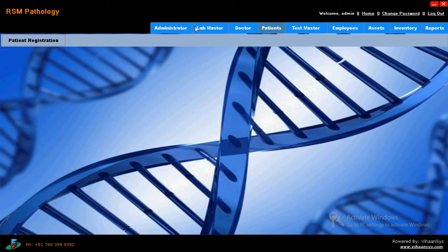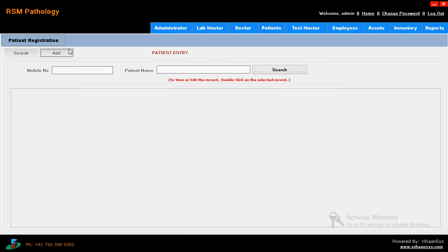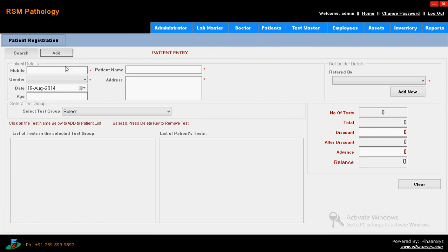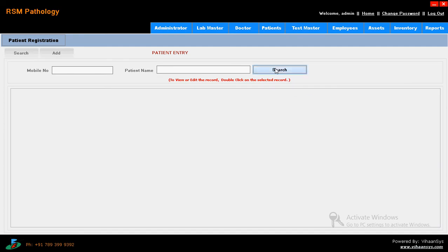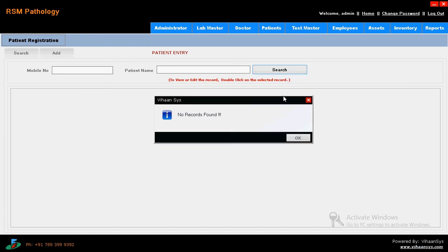Then patients - come to patients. Patient registration, outpatient registration. Here you just add complete patient details: mobile number, name, gender, address, age - everything you have to enter. Now here, this is called patient registration. If already entered, you just go for search. That's it, you got it.